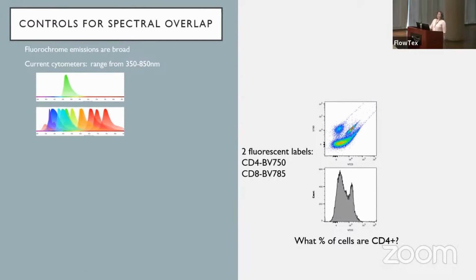So that means between 350 and 850, we have how many? That's 500 nanometers. The guys in the back, we're expecting you to pop up here, right? So that means that maybe 5 are going to not overlap appreciably, okay? So just expect that there's going to be overlap until proven otherwise. That's just a good rule of thumb to start with.